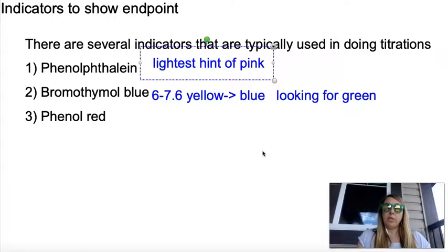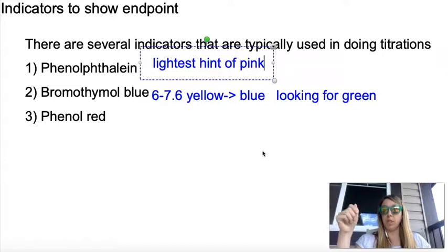So generally what we do in our first trial is we add 5 mLs, and then we close the valve, we swirl it around, we check to see if it changed colors. If it didn't, we add 5 more mLs, we close it, we swirl it around, check to see a color change. And we keep doing that until the color changes. Sometimes I don't have to do a full 5 mL increment. Maybe I'll have gotten to 10, and then I'll be adding, and then all of a sudden I'll be like, whoa, that totally changed colors, and I'll stop before I hit 15.